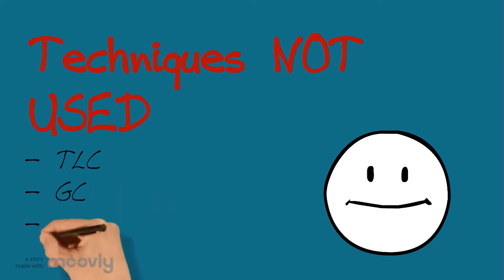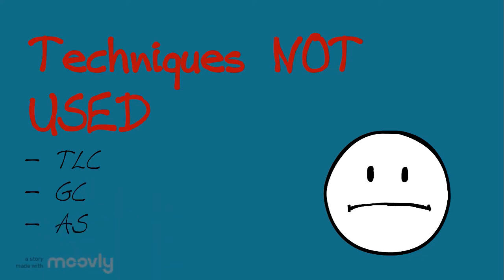For our experiment, we did not use TLC, GC, or AS. We didn't use TLC because we have a pure substance, and since it only shows one dot, it would not be useful in determining the unknown substance. While we did implement GC, it was not useful in determining the pure substance because it only indicated one retention time. We didn't use absorbance spectroscopy because our substance was colorless. Additionally, since we only had one substance, there would only be one lambda max and we would have nothing to compare it to.